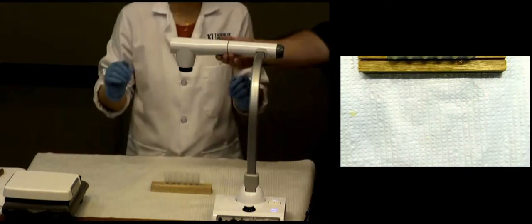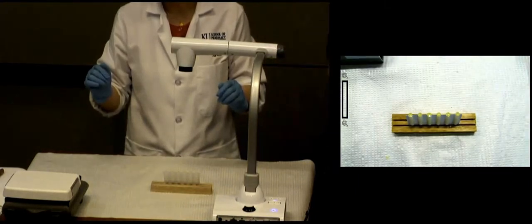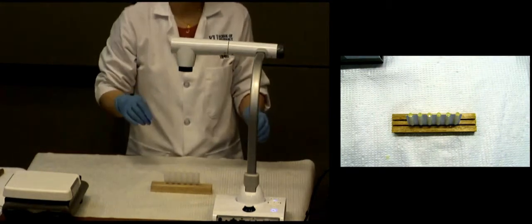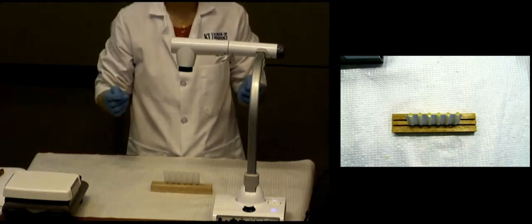Okay, so we finished the pouring into the mold now, and this is going to take another, how long does it take to solidify? A minute or two? No, 20 minutes. You really do. For you guys, even on the wet lab, that's the problem for you. It's kind of like a hurry up and wait lab, because it does take 20 minutes.